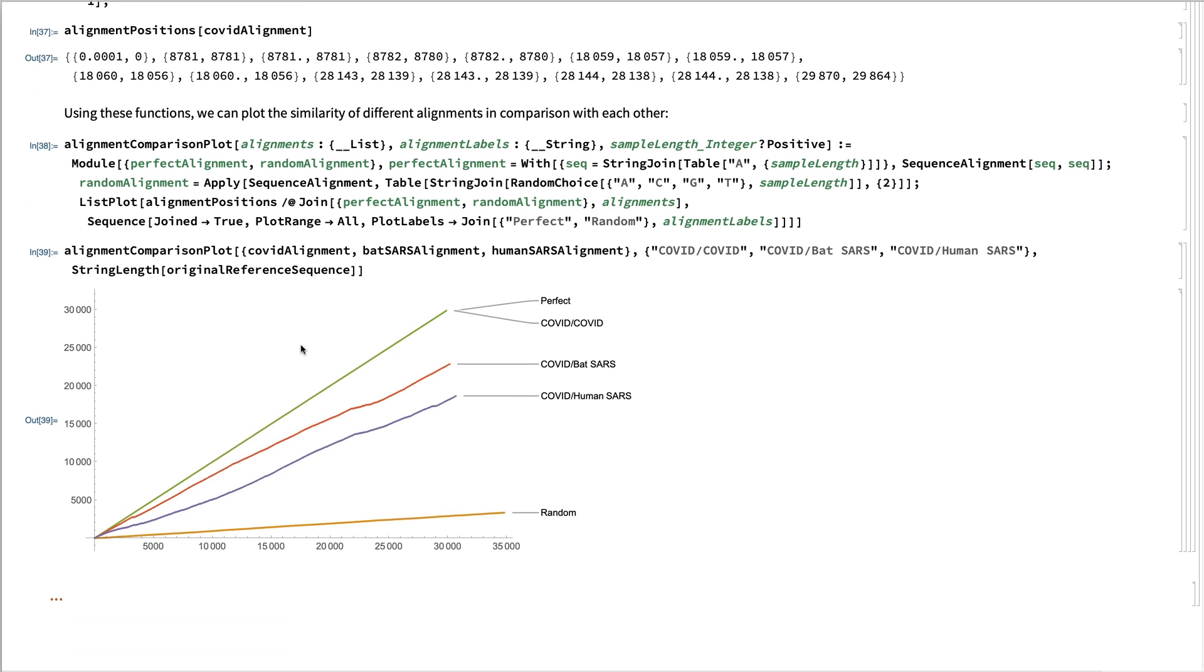And here we see if we plot all of the different alignments against each other, we'll see that the coronavirus comparisons nearly perfectly line up. And the broad stretches of similarity for the bat SARS to the coronavirus.